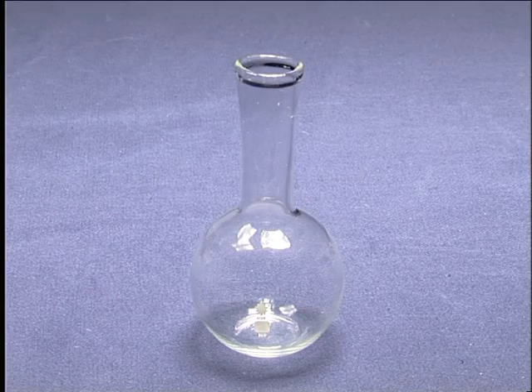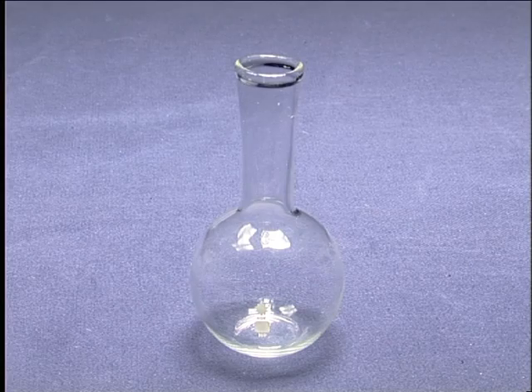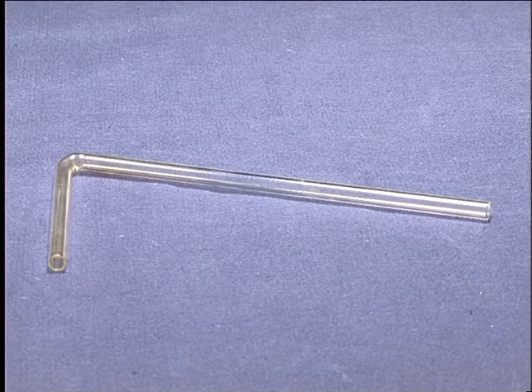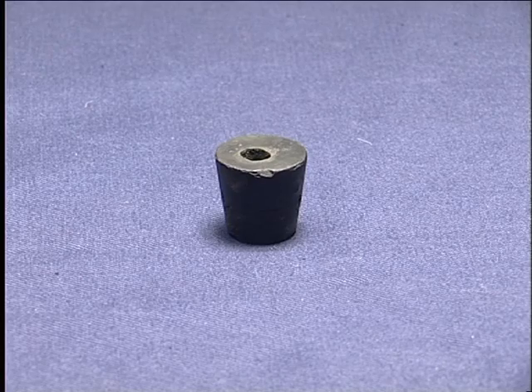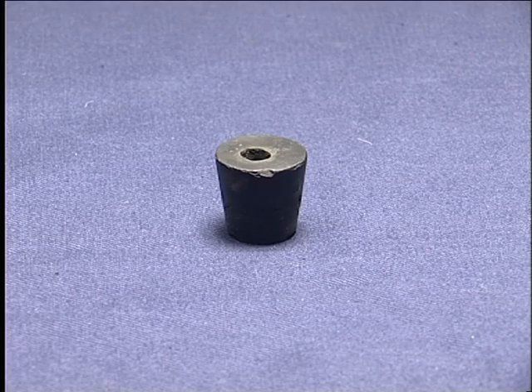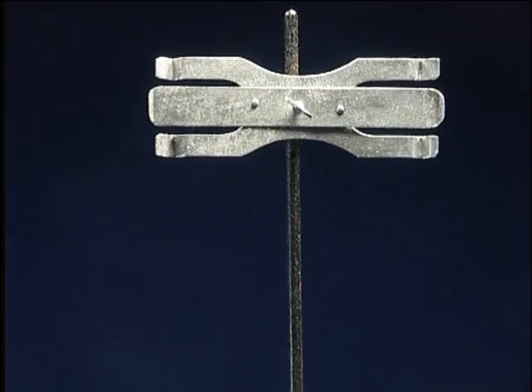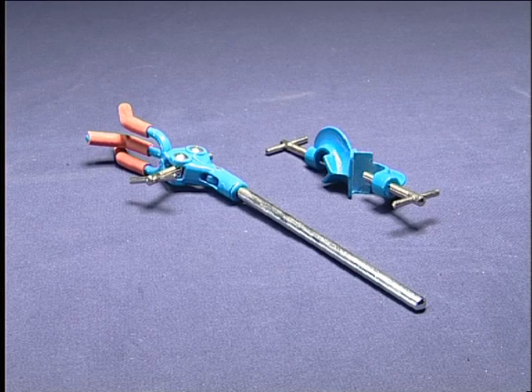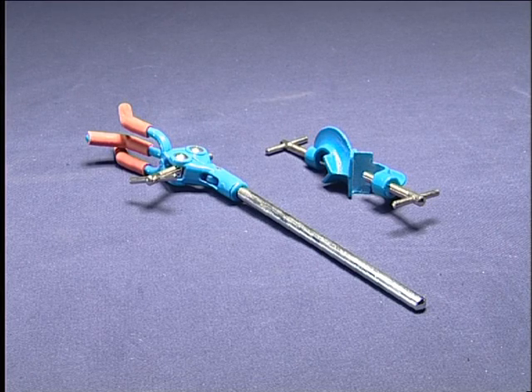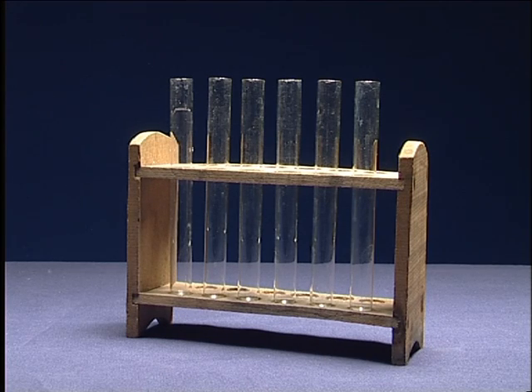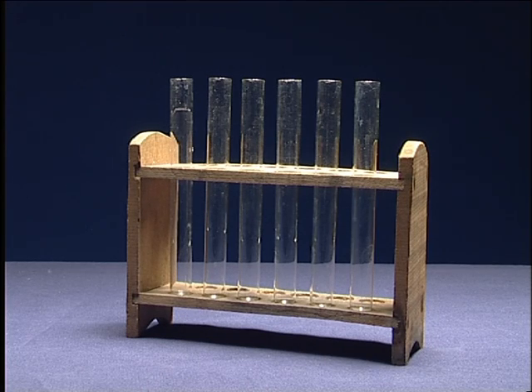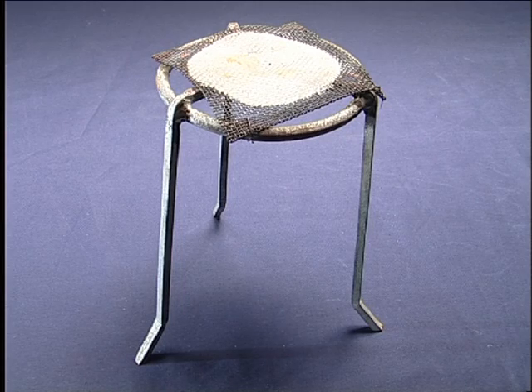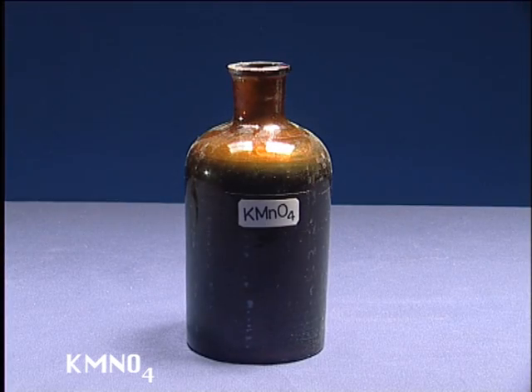Equipment includes Florence flask, L-shaped glass tube, perforated stopper, tripod, clamps, rings, graduated cylinder, test tubes and test tube rack, wire gauze, and potassium permanganate.